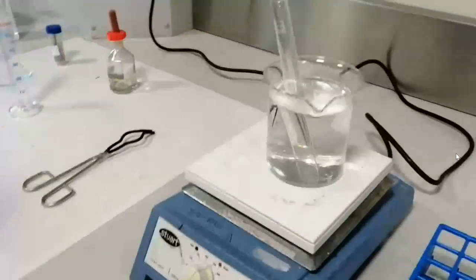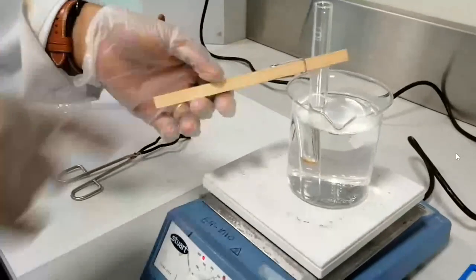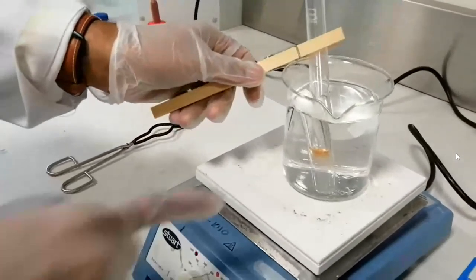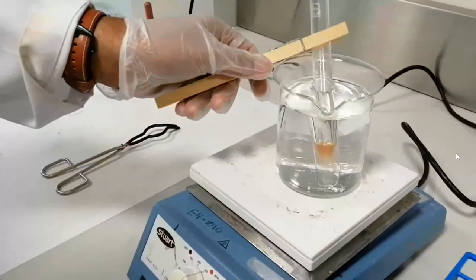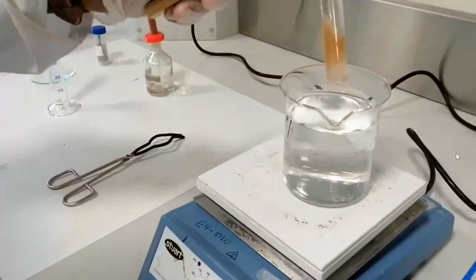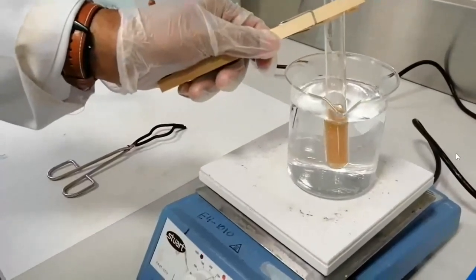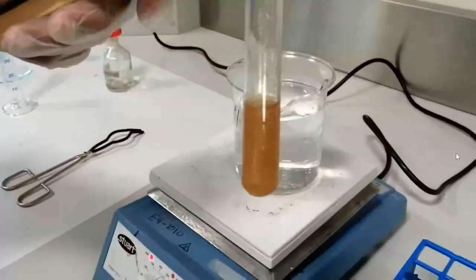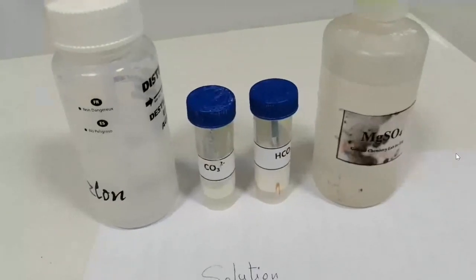If you let this reaction mixture be heated up, you will see reddish brown precipitate is formed. Actually, it has started to form. You can see that by heating. You can see the reddish brown precipitate. Great. Very good. Let us go to the second confirmation test.